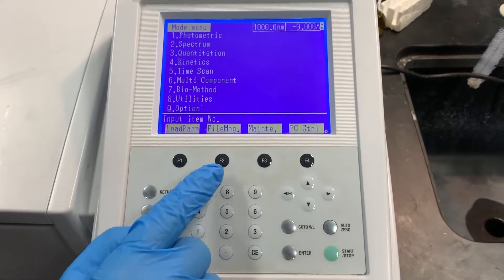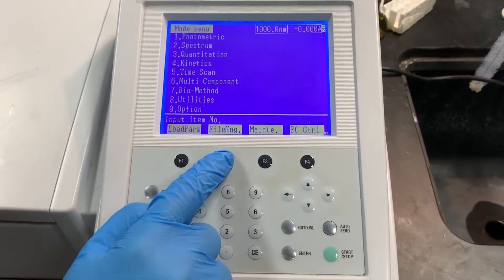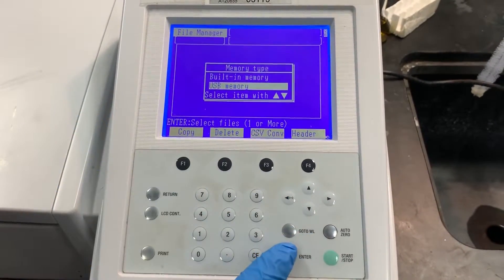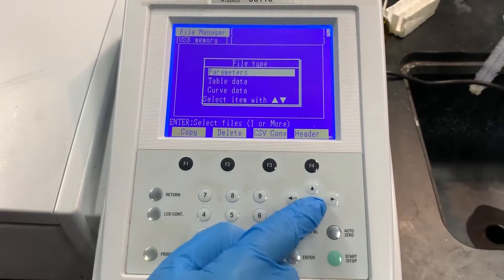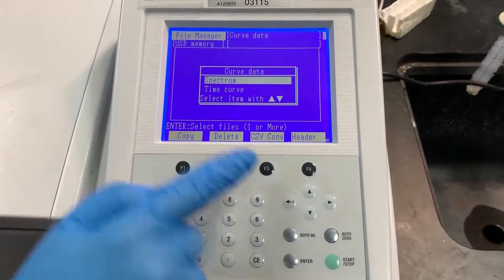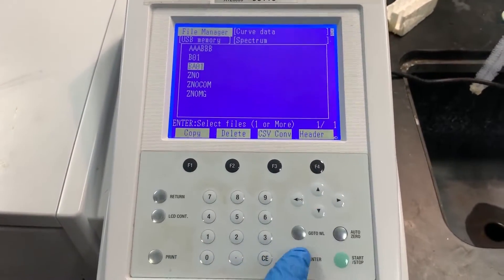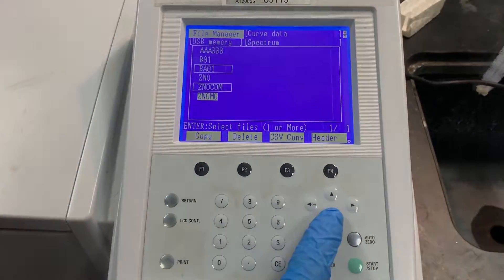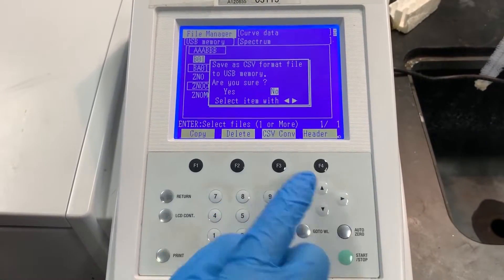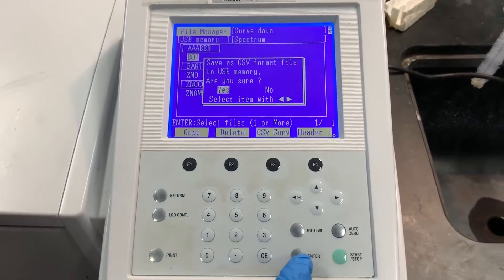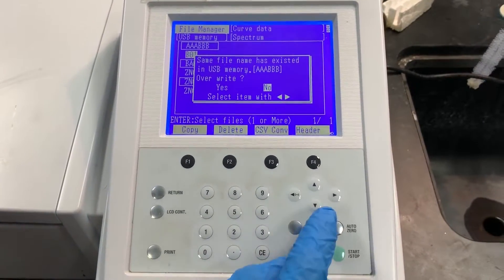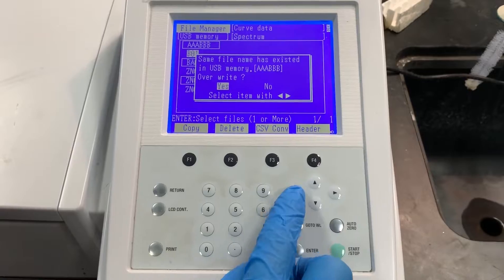To save a file to a thumb drive as a CSV file, select file manager, USB memory, curve data, spectrum, and select the desired spectrum file. Select CSV conversion and select yes. Overwrite any of the files if necessary.